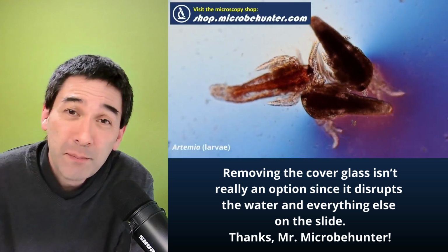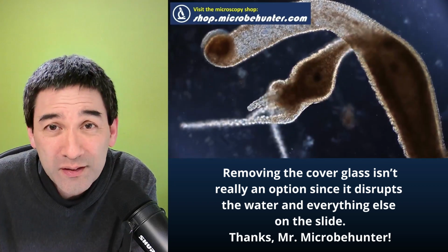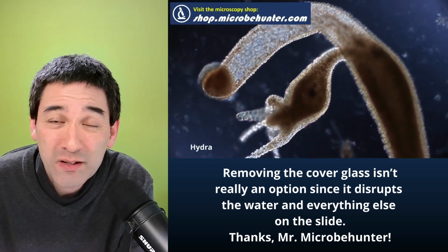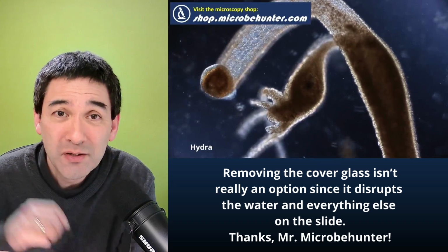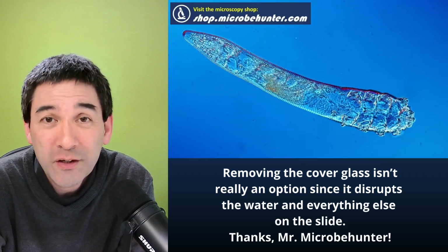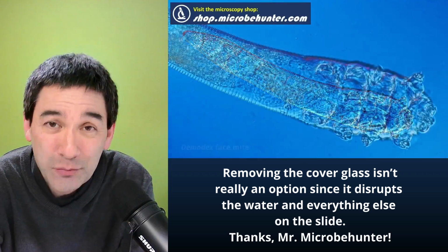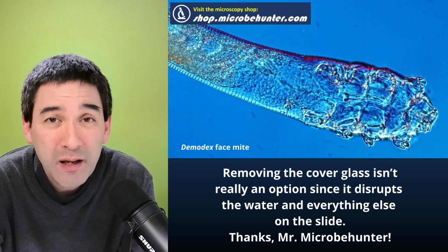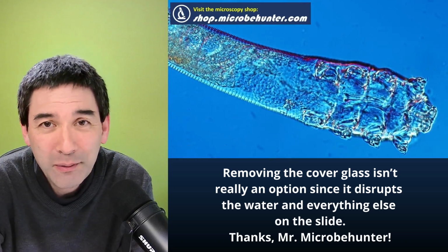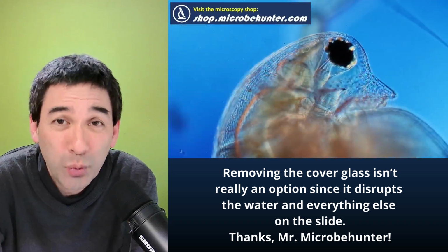Yeah, and by picking it off, I usually rest the tip of the pipette on the microscope slide for stability. And I also support it with my other hand a little bit. So basically with one hand, I'm holding the pipette, and with the other hand, one or two fingers, I'm stabilizing the tip of the pipette, which is also resting on the microscope slide. And this way I'm carefully approaching the tardigrade, and then I quickly suck it up and am able to transfer it onto a different slide with a little bit of fresh water again.